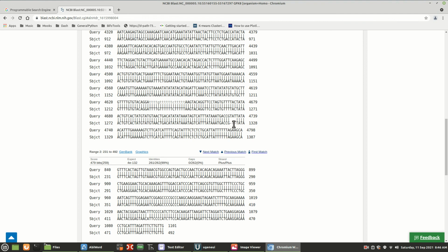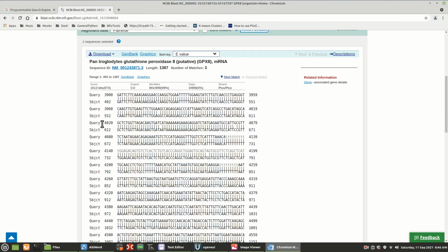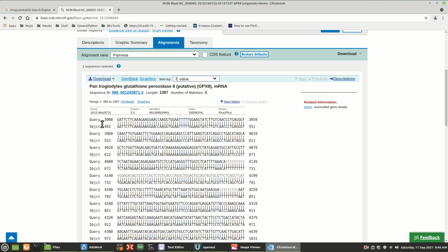Here's a piece that's been deleted. Now you have to keep track of which one is the query and which is the subject, as in which one is the chimp and which one is the human. Usually the query is the one you're searching in.